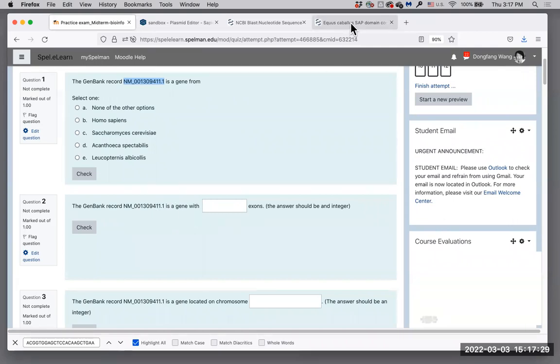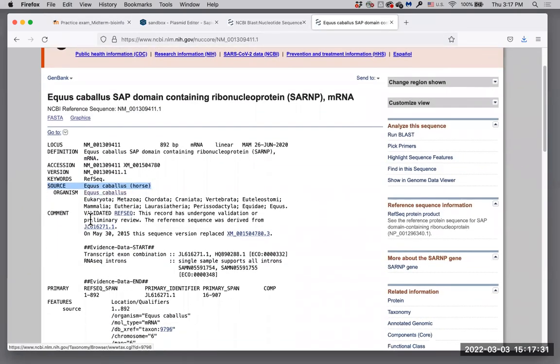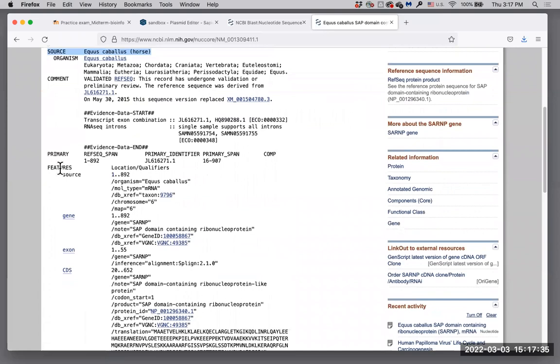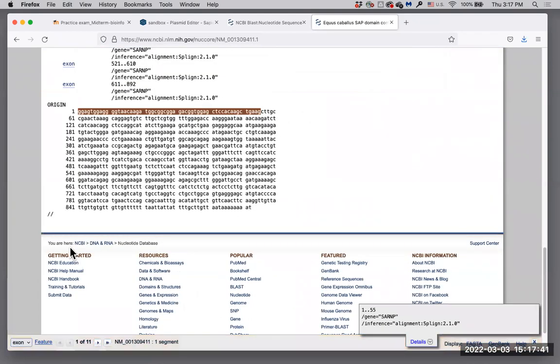This asks for how many exons. This information is under features. Under features, one of those displays will be exon, so I'm going to click on exon. This opens up an information tab at the bottom of the page. As I flip through this, you can see different regions of the gene are highlighted. So we're looking at exon 5, exon 6, exon 7, 8, etc.